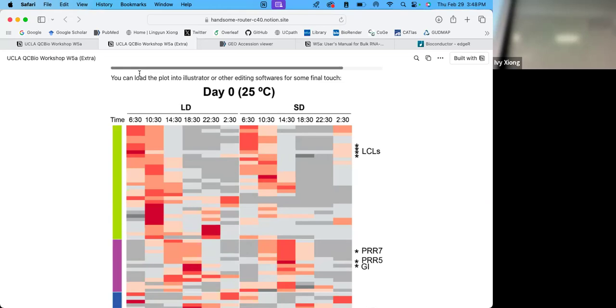The last two copies I work. Okay, and probably because of the issue with folders. Yeah, maybe we could find, oh yeah, the post QC file was somewhere else. Yeah, okay, so that's probably right. So if you move to the post QC and then try the alignment.